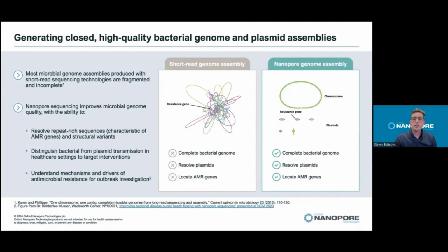When we're characterizing bacteria in the context of outbreak investigations, we often don't only want to know what the resistance genes are, but where they're located in the genome and what else surrounds them. When you sequence with short-read sequencing technologies, it's really difficult to get this information. Bacterial genomes have a lot of repetitive elements, and short sequencing reads are often not long enough to completely cover these regions. So even if you sequence the whole genome, if you try to stitch these reads back together, you'll end up with a bunch of short stretches of sequence, and you don't know how they fit together.